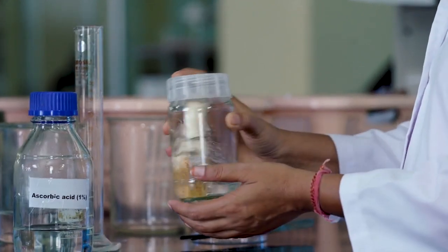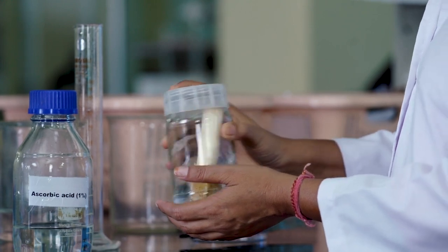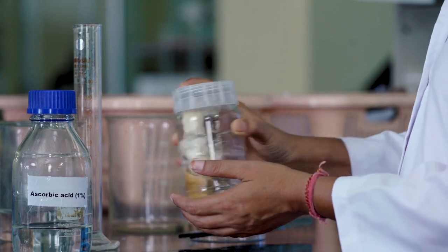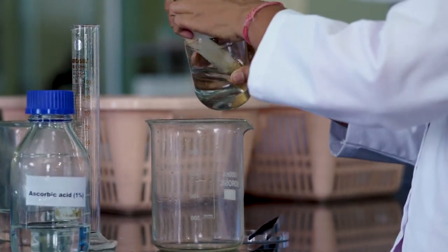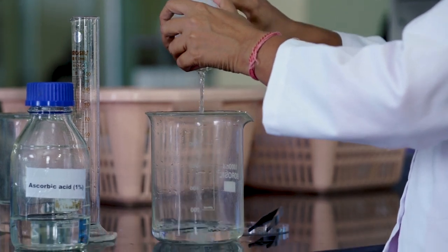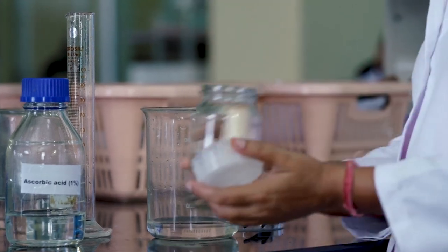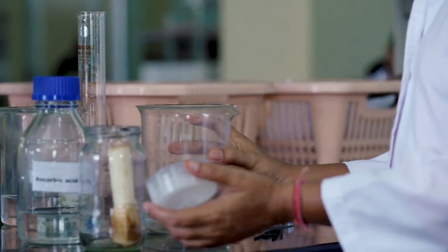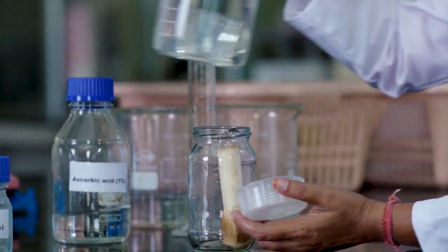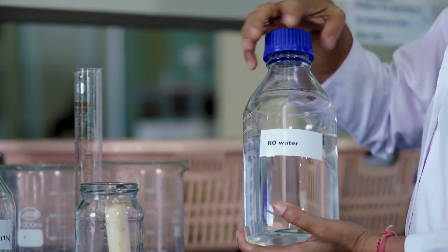Now as you can see, she is treating the explant with ascorbic acid solution so that the concentration of the polyphenols goes down. After treating, we will remove the ascorbic acid solution from the glass jar. Now this will be treated with sterile RO water. We will wash the explants 3 times.